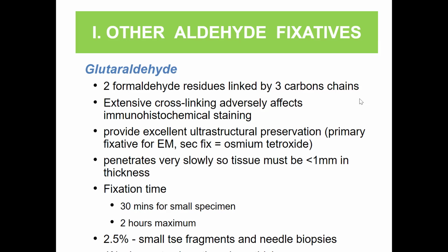So your glutaraldehyde penetrates very slowly, so tissue must be less than 1 millimeter in thickness. Fixation time is 30 minutes for small specimens and 2 hours for thicker specimens. So you have concentration 2.5 for small tissue fragments and needle biopsies, and I think 4 is the concentration for bigger specimens and thicker specimens.